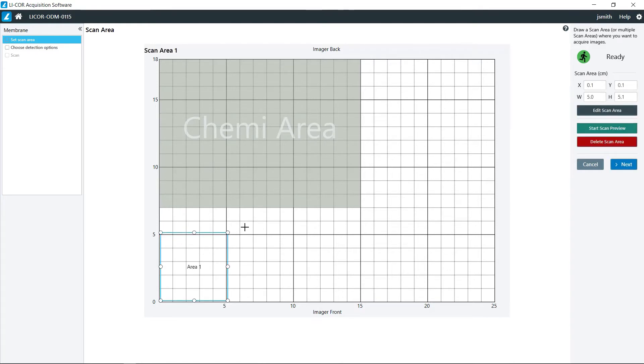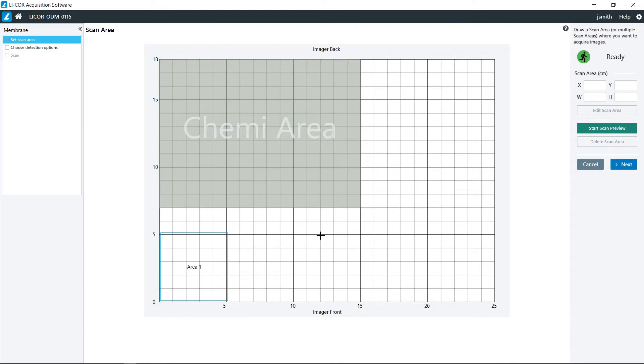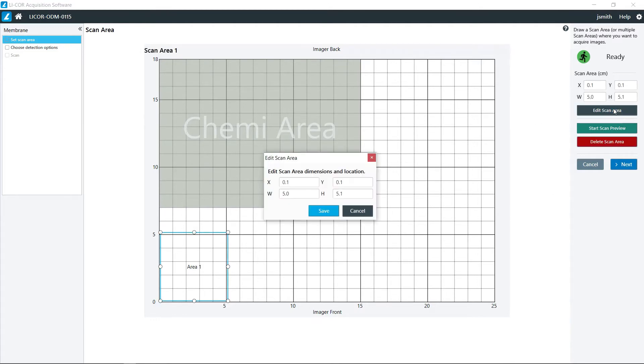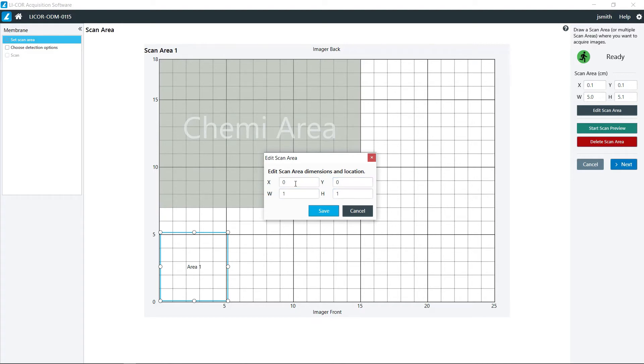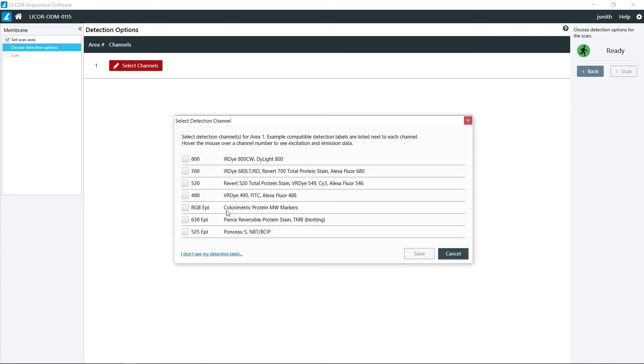You can do multiple areas just like that, and if you only have that one area I just deleted the other one. If you want to manually set the values you can click this edit scan area. Now just for the sake of time I'm going to make this a rather small scan area and then click next.